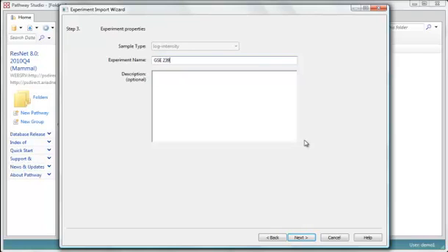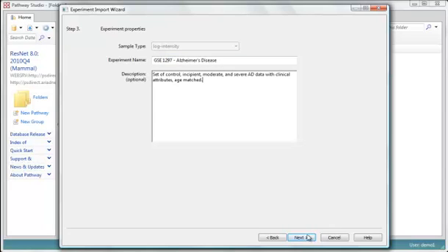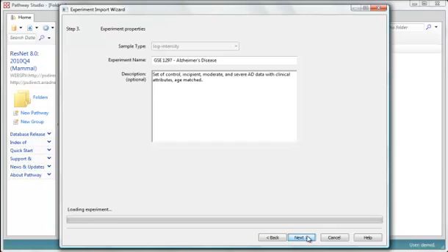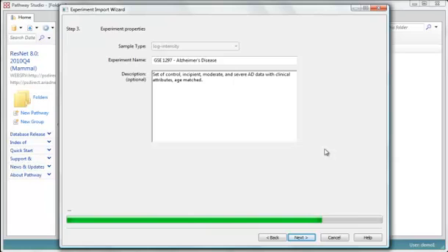I can put some annotations here that will help me find the chip. This is going to be the name that actually shows up. So now it's loading the experiment. This part goes rapidly.